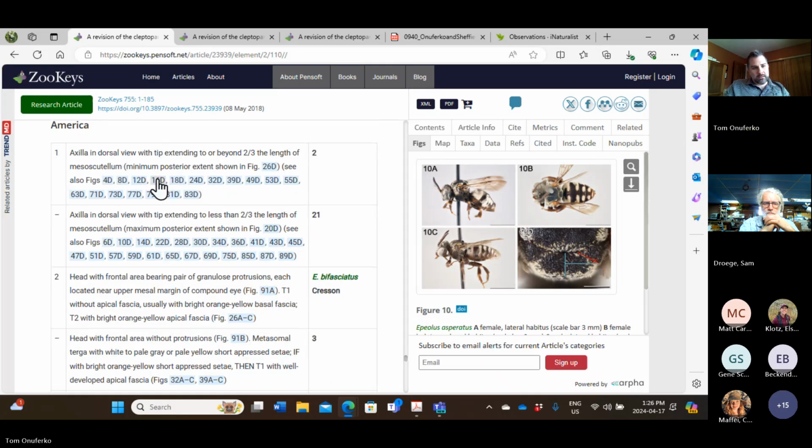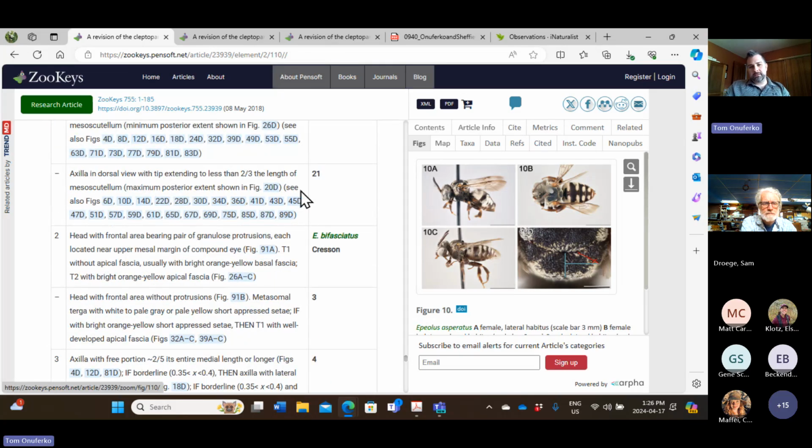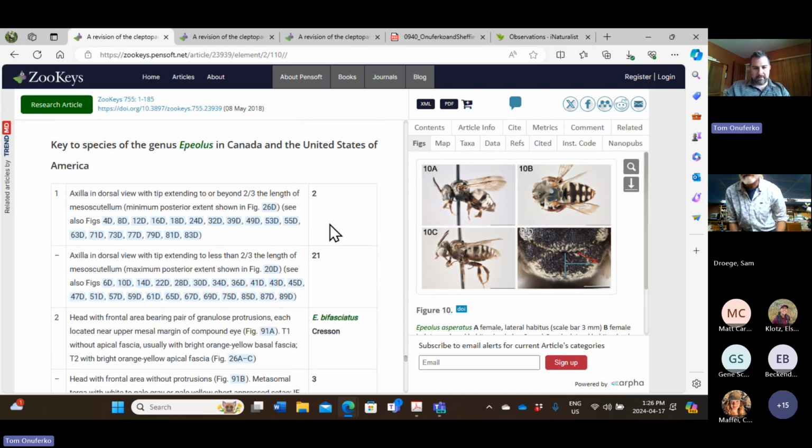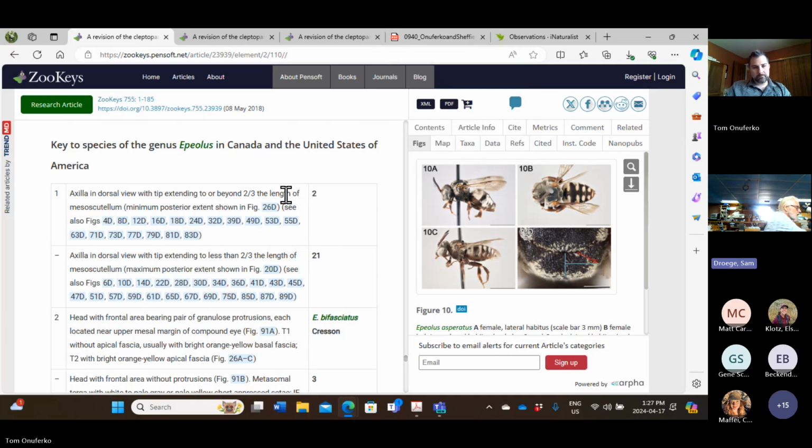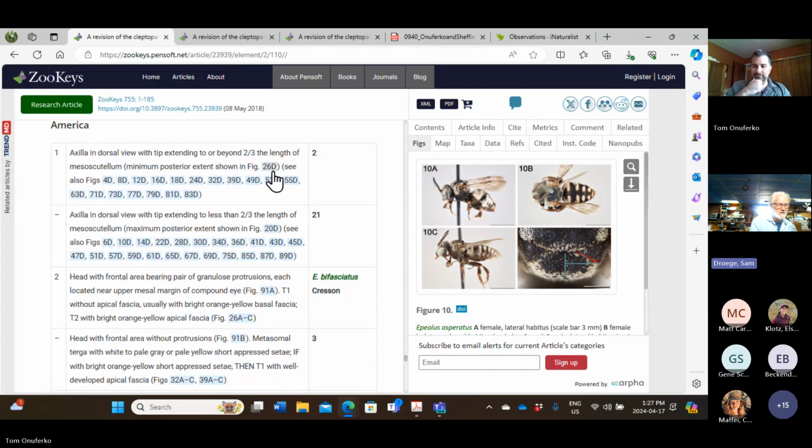Sam, do you want to pull up maybe an example of one of the specimens you have? It doesn't matter which one. I think most of yours will key out earlier in the key. Yeah, I'll pull a scutularis since I have a lot of those. And while I'm setting it up, you can talk about other things, because it'll take me a second to get it in the viewfinder and all that kind of good stuff.